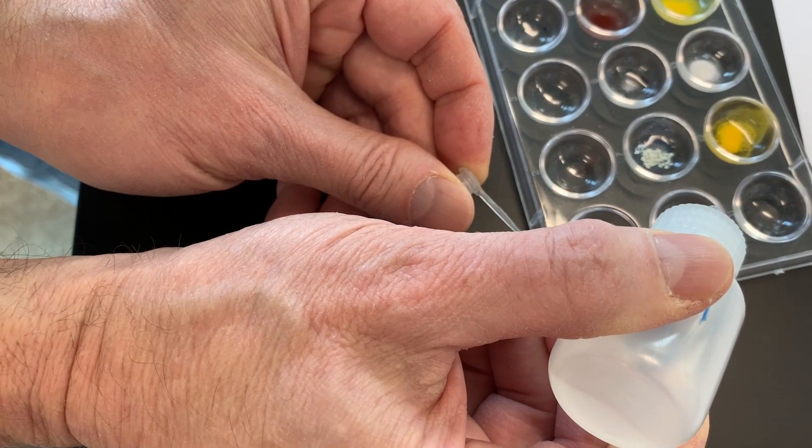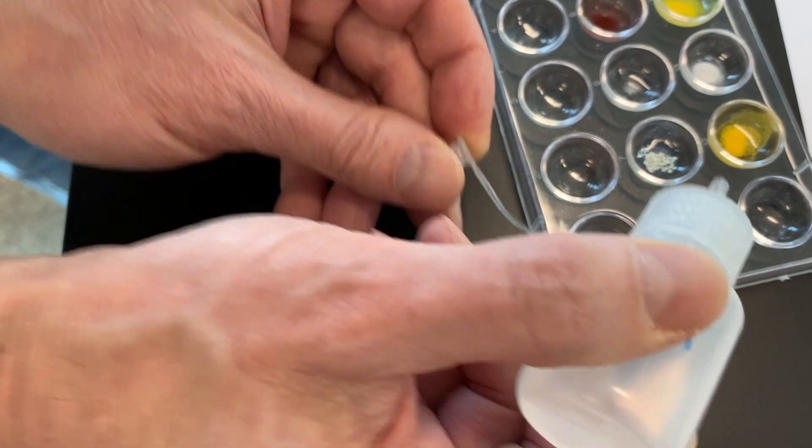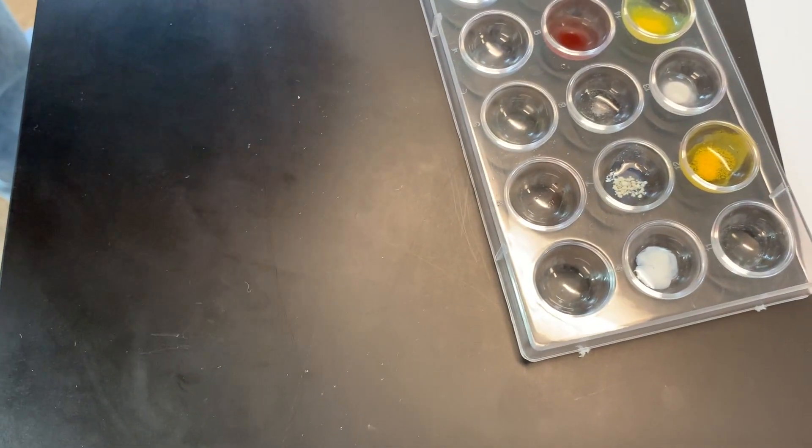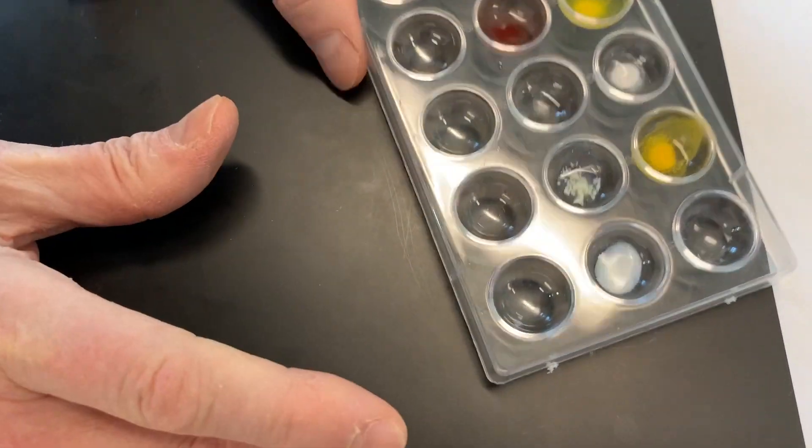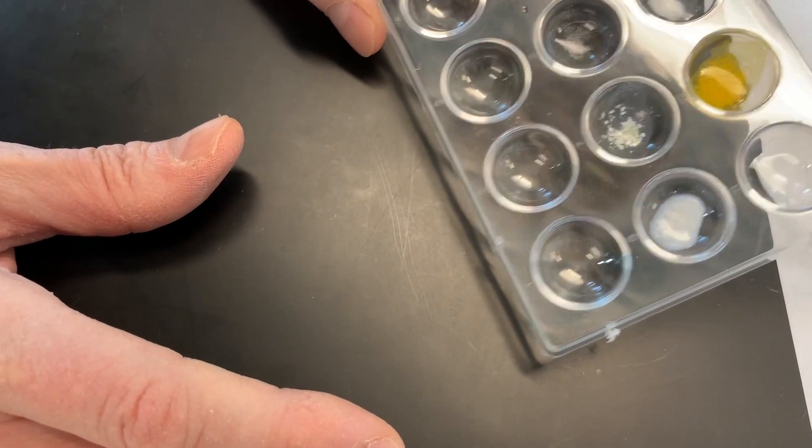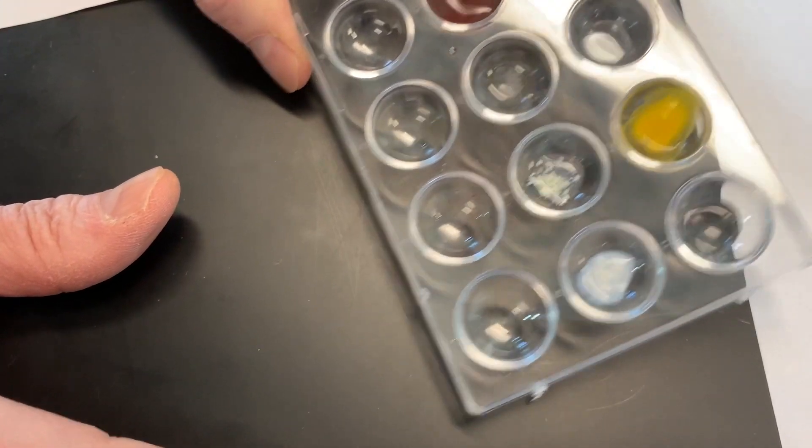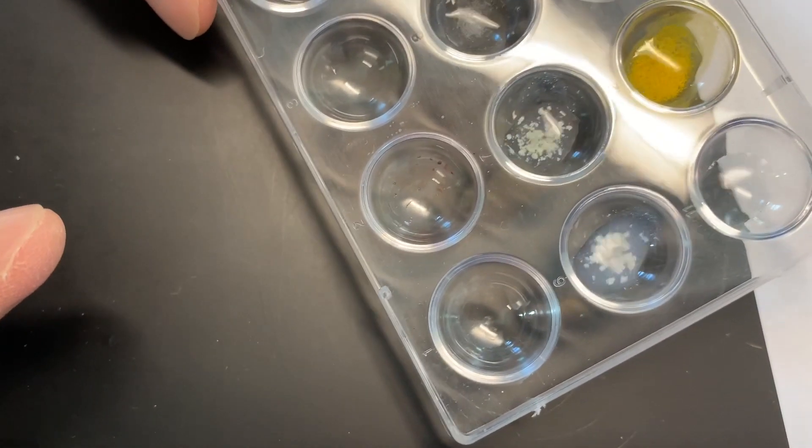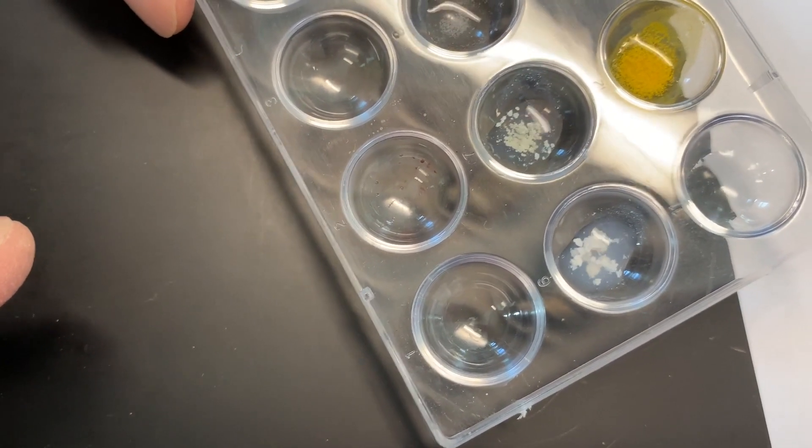Now for the two drops of potassium chloride. It quickly coagulates into this clumpy white stuff and the remaining solution is colorless.